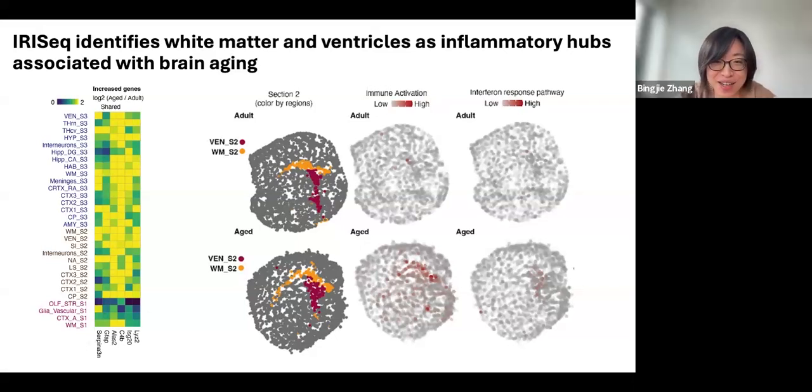Okay. Thank you. Our next question is, with varied resolution by changing the bead size, can you explain more about how we can study cell-cell interactions with your method? If we have the higher resolution, how are we able to study cell-cell interaction? It shouldn't be that different, because when you have higher resolution, the deconvolution will be closer to one, so it's closer to the single cell level, and you can essentially do the same analysis.